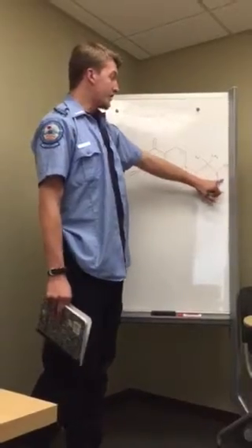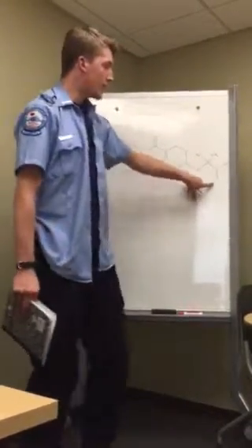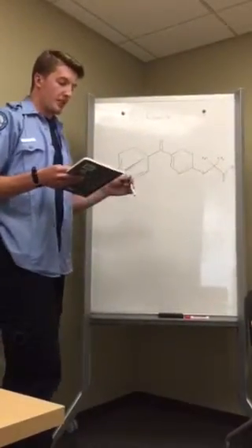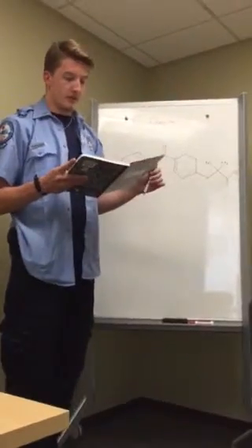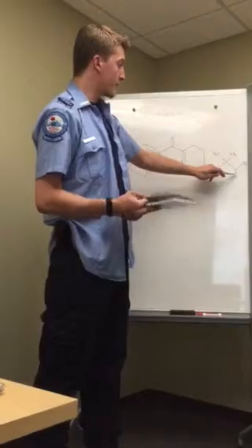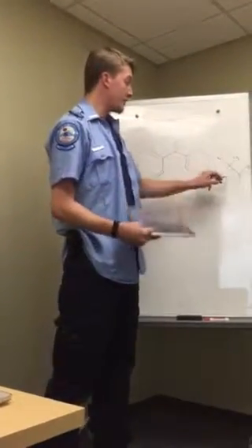The carboxylic acid group, we're actually dealing with two different bonds. One is the double bonded oxygen and one is the actual hydroxide group. The bond with the double bonded oxygen right here is pretty similar to the one up here in the ketone. It's 1700 to 1725.